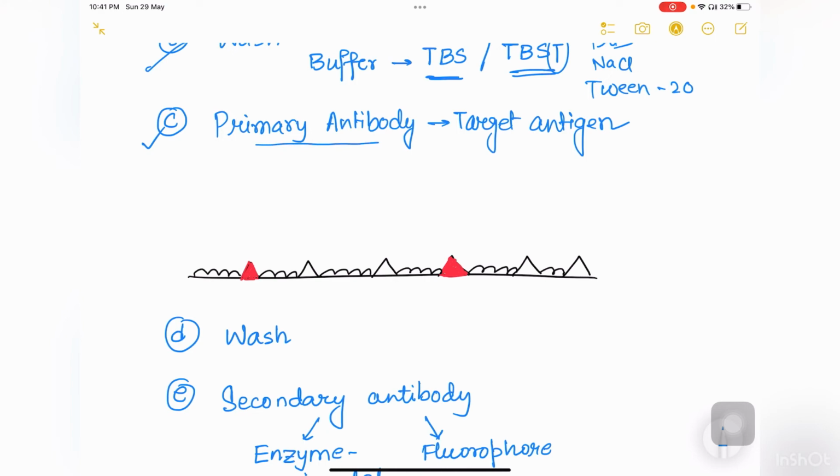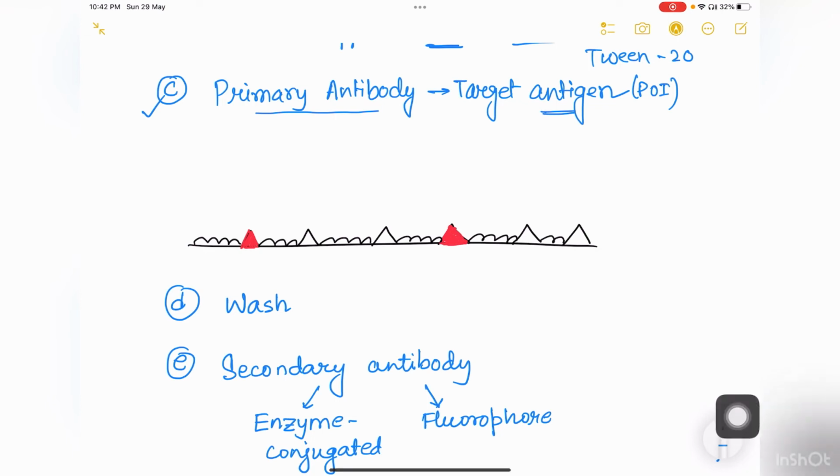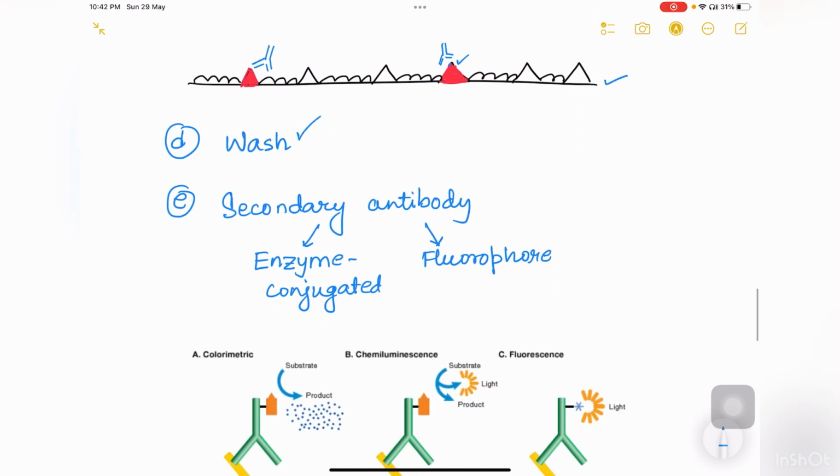Primary antibody is the antibody which is specific to our target antigen, and the antigen here is the protein of interest. Now, after blocking, this membrane is blocked with non-specific proteins, and there is our protein of interest also. So what will happen when we incubate this membrane with primary antibody? Primary antibody will come and bind to this protein of interest. The membrane has to be incubated with primary antibody for some time, and then it has to again be washed so that we can remove the excess primary antibodies which are not bound.